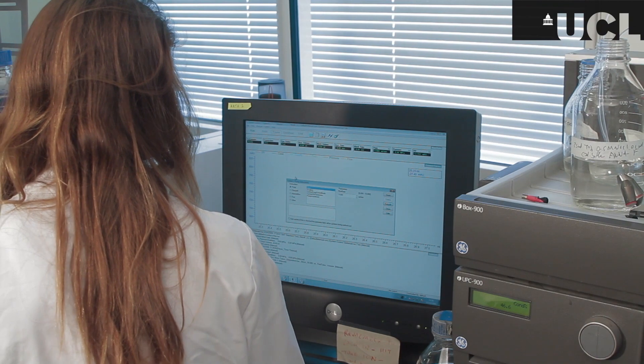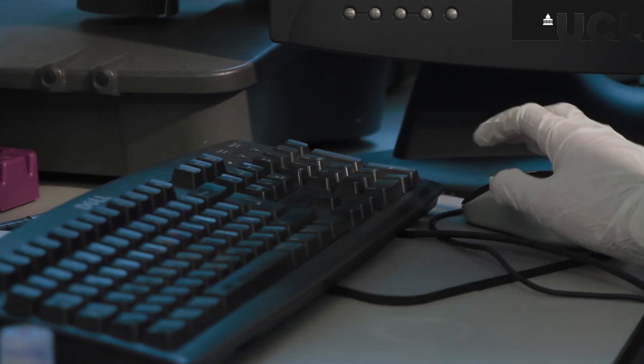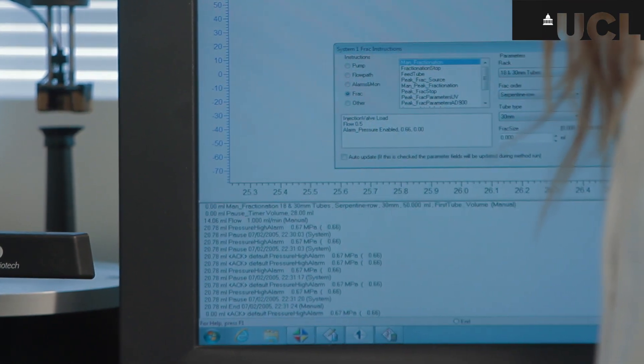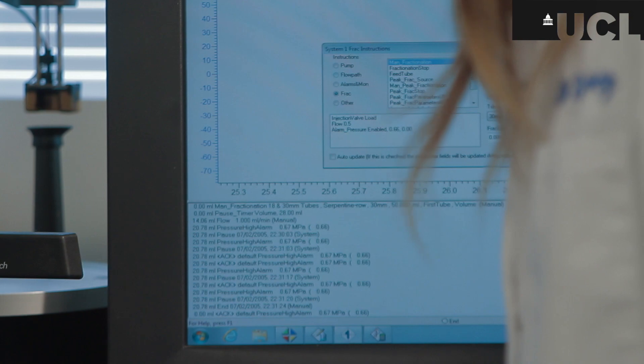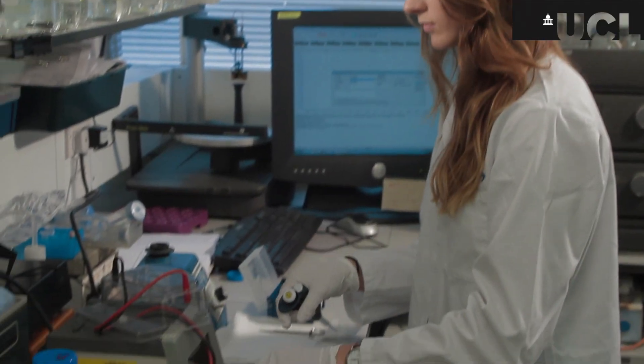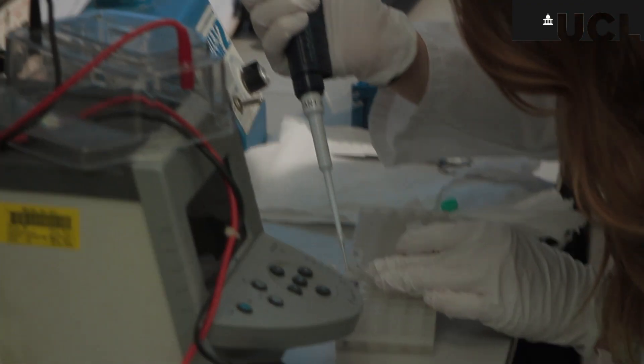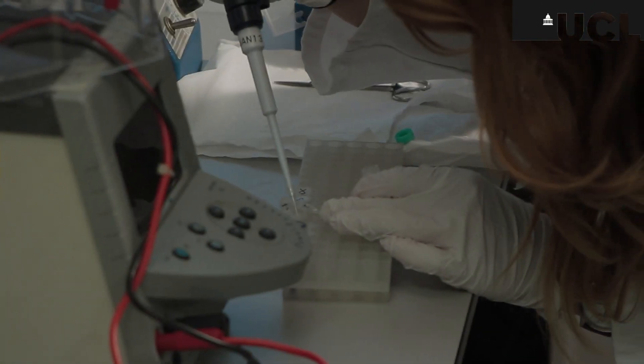The next step is to manually input a set of commands into the ÄKTA purification system. The ÄKTA purification system is great because you can set parameters and it's controlled automatically rather than manually. When carrying out protein purification, it's particularly important to take samples to know the exact location of your protein, whether this is in the supernatant or in the pellet.